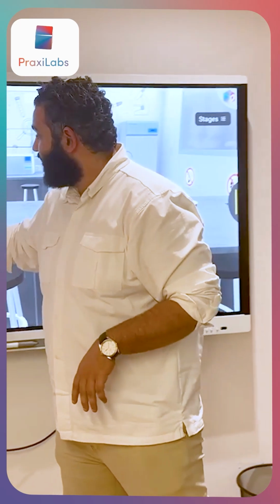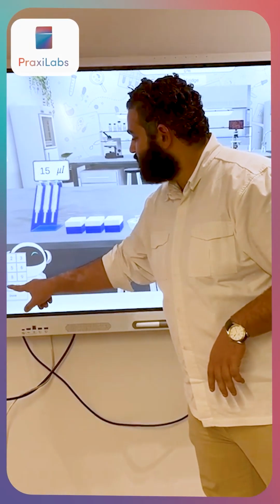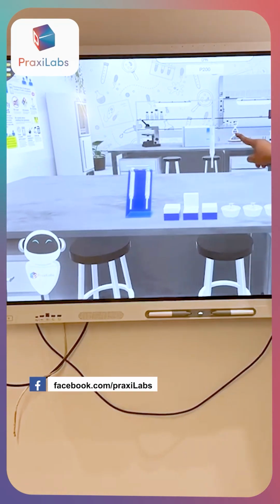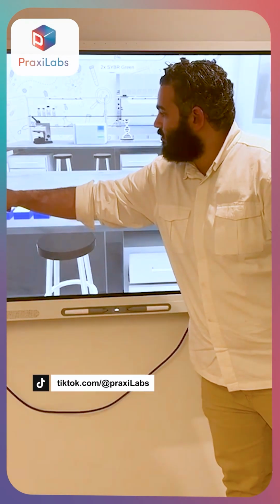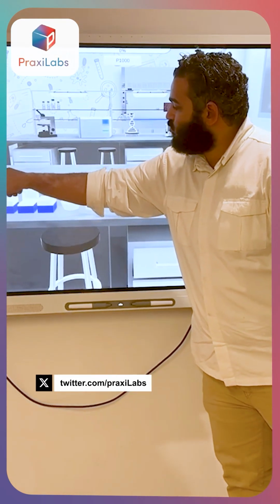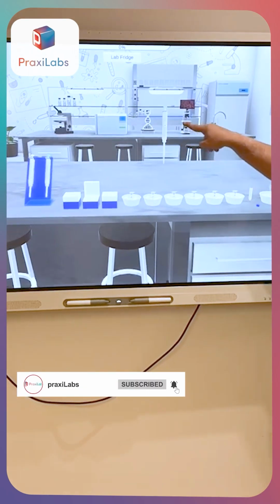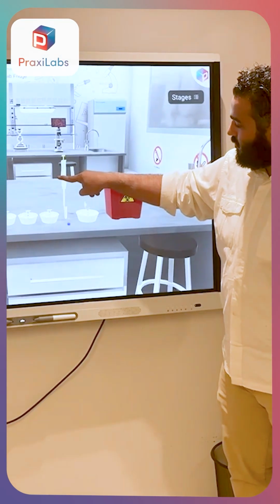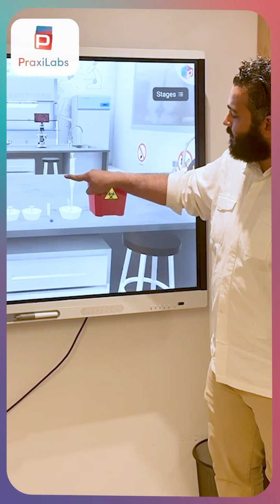We are going to complete preparing our master mix. As you can see, I will add the required amount, 150 microliters. Then take the micropipette, open the tube firstly, then choose the right one, add the tip, then take the required amount as mentioned, and put it inside the sample.